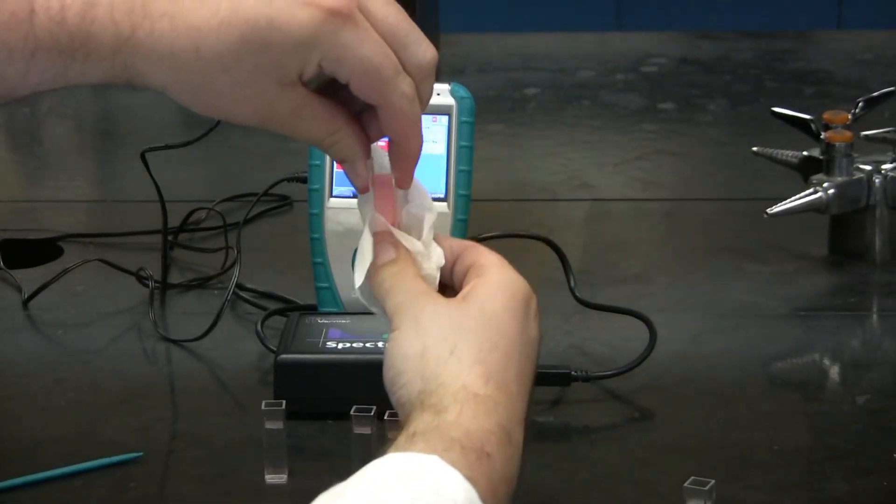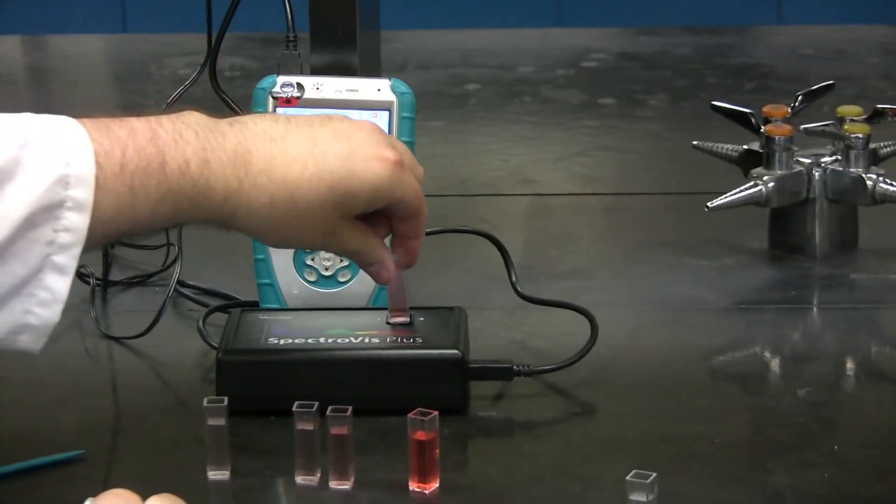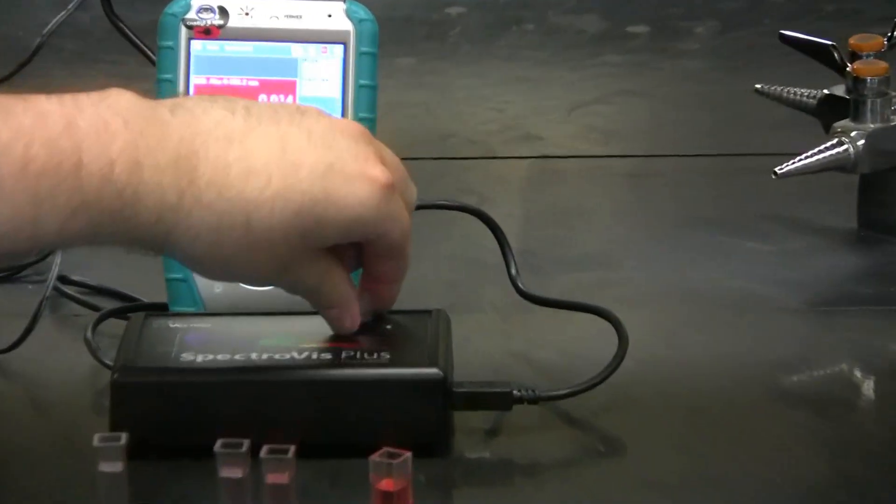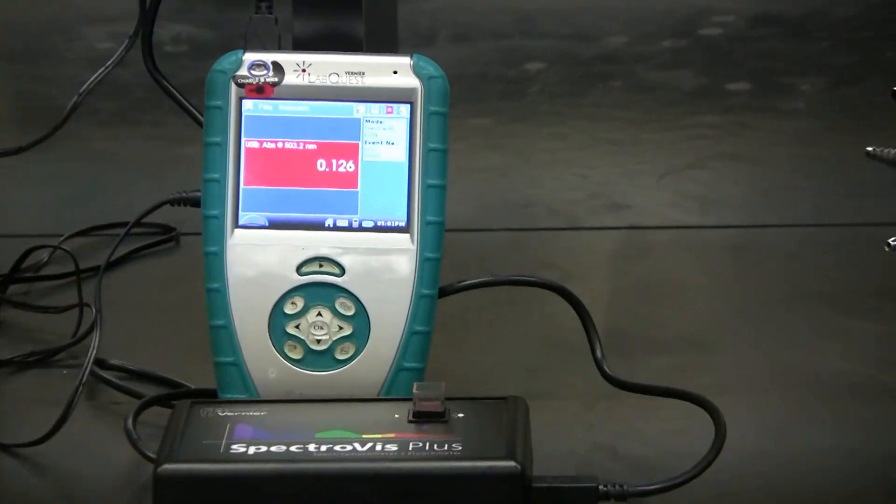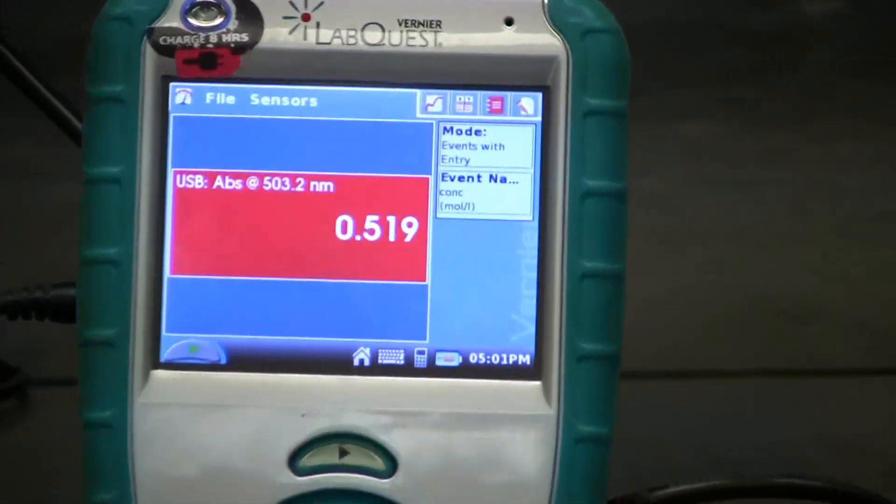Start by wiping it with a Kim Wipe and then place it into the cuvette holder. Record the following value and solve for the concentration using the previous equation.